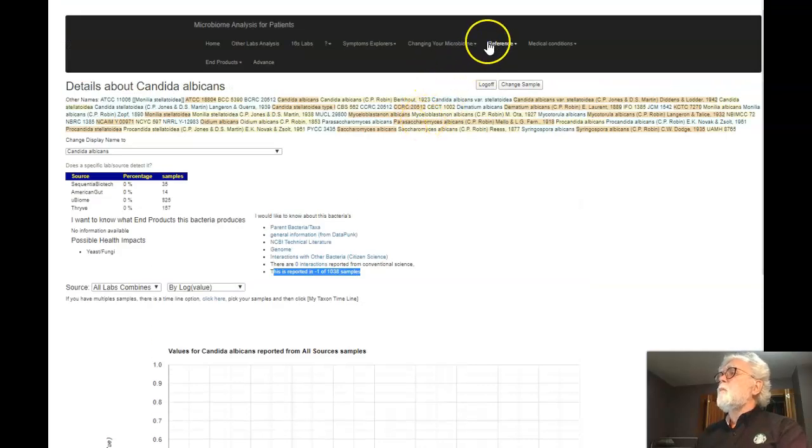The modifier base is generic, so it will not depend on whether or not it's reported in 16S. It simply looks everything up. Okay, I think at this point of time I've covered most of the items.